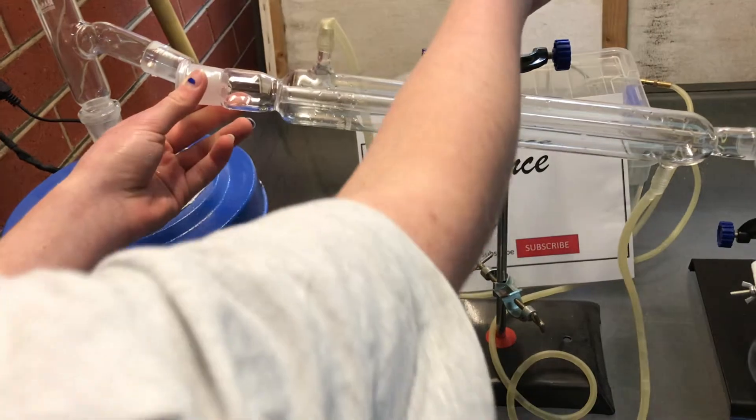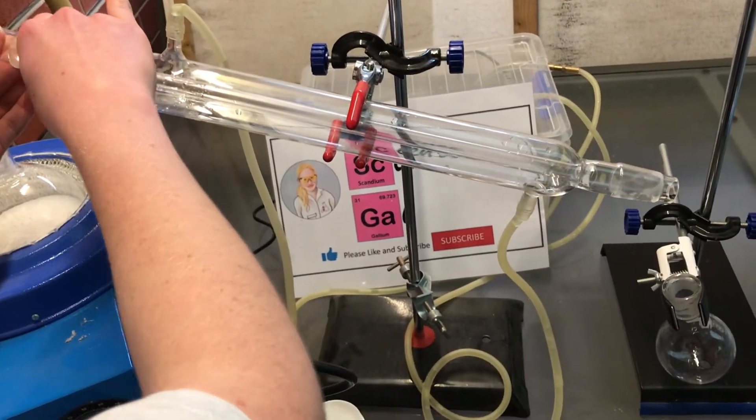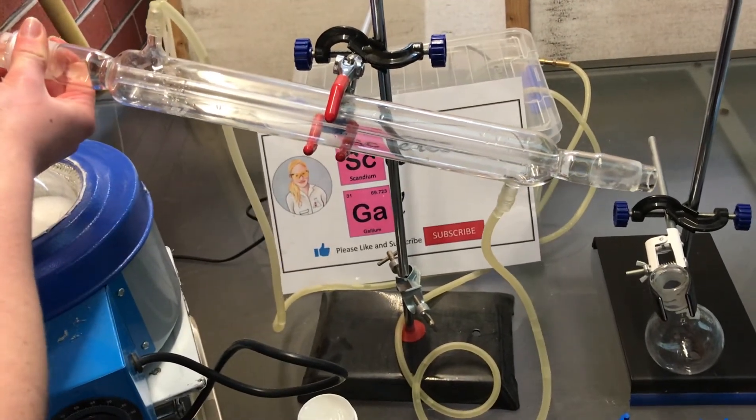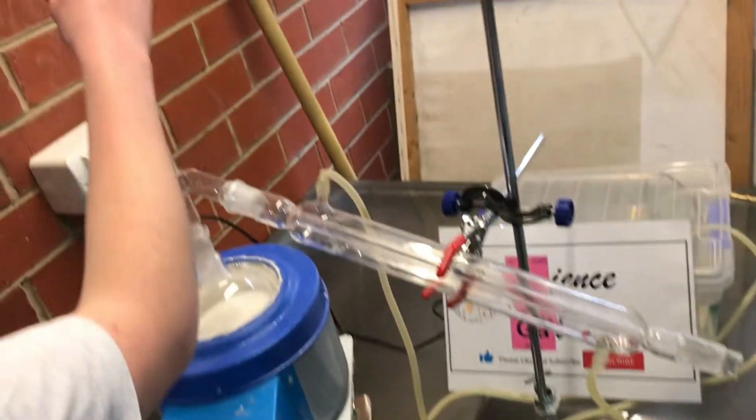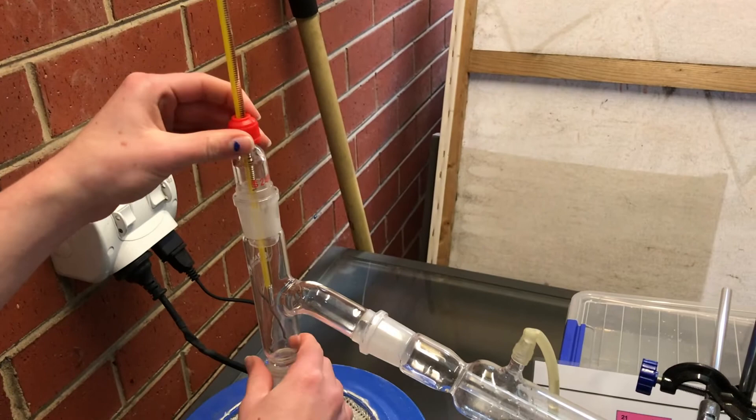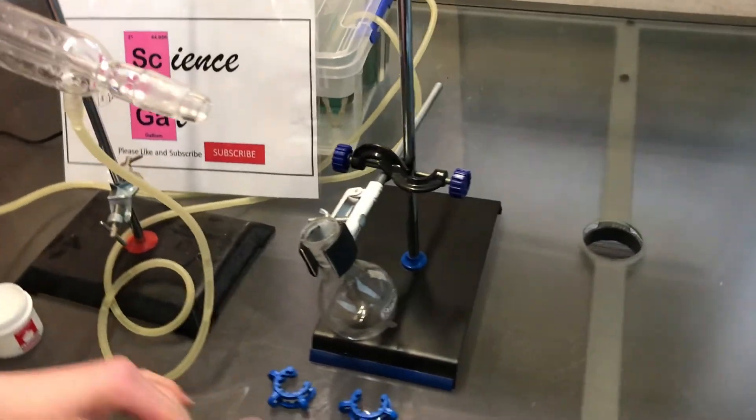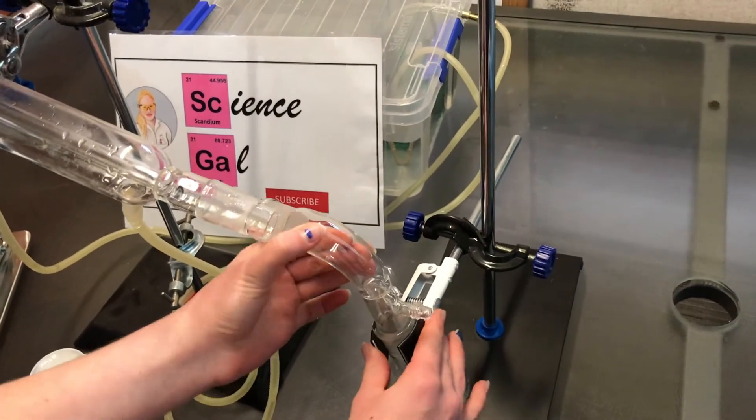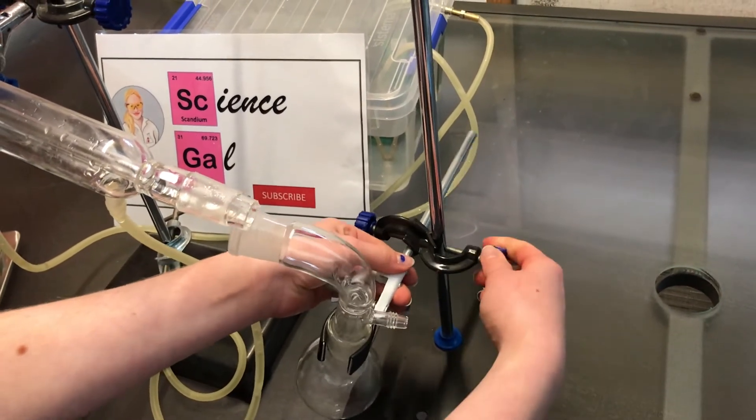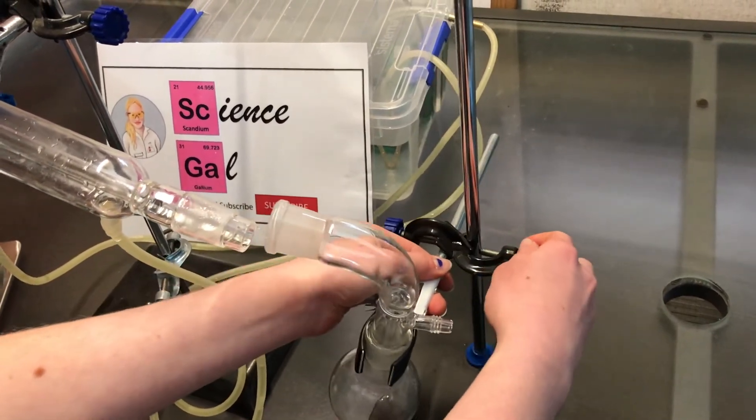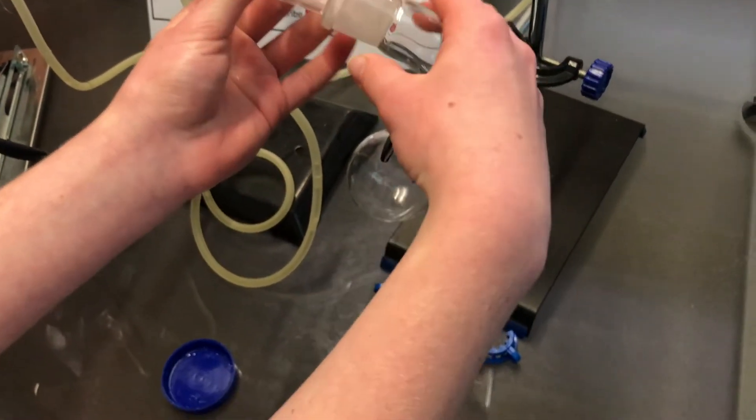I then attached the three-way adapter to the condenser and the thermometer. The vacuum adapter is attached to a 50 milliliter round bottom flask, which is used as the receiving flask. Then I carefully raised the clamp and attached it to the condenser. The whole setup is supported by two retort stands, making sure that the condenser and receiving flask are secured by clamps.